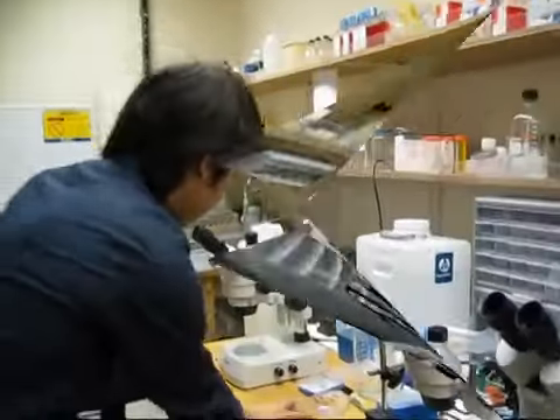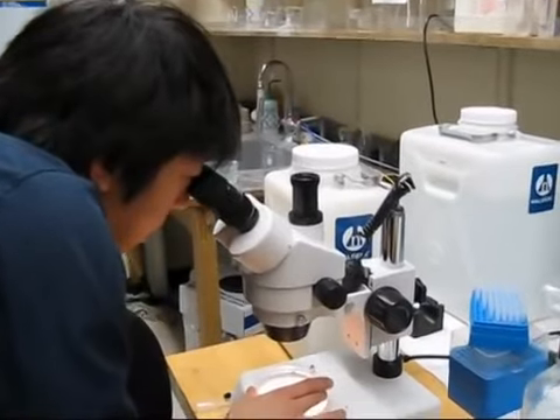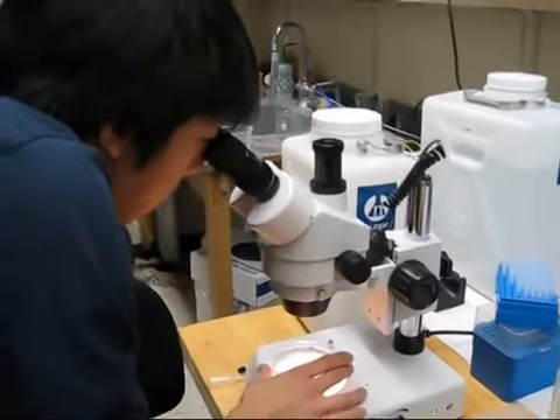We have some that were two days old. We can show them a small video screen or an LCD screen and create different patterns of illumination — spots, moving bars. These are the kind of typical things that have been done in similar fields.